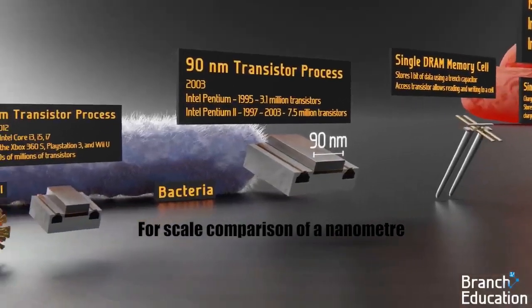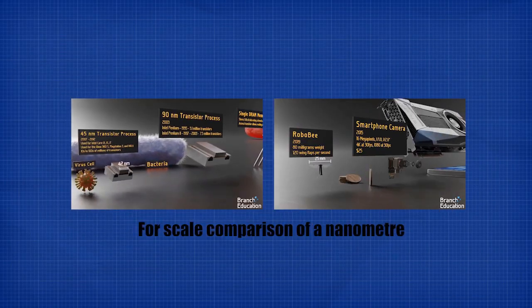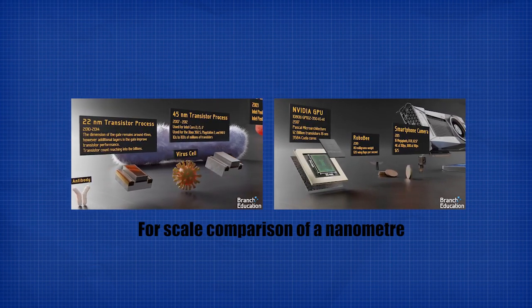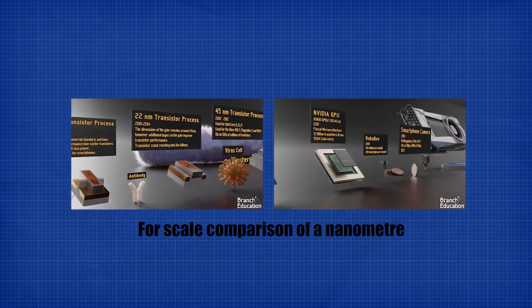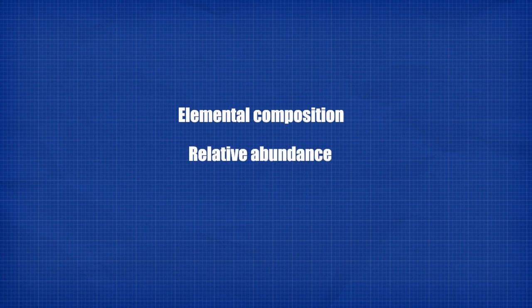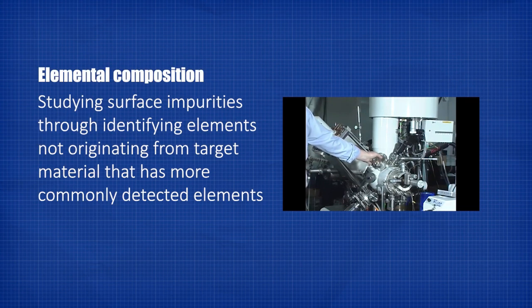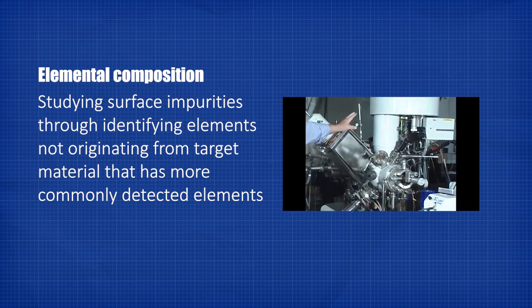More specifically, XPS is useful in determining 3 key quantities. Besides insight into the behavior, properties, and structure of materials, studying elemental composition provides useful information on the presence of impurities on material surfaces, which sheds light on potential surface defects and disruptions in the material's optimal functions.